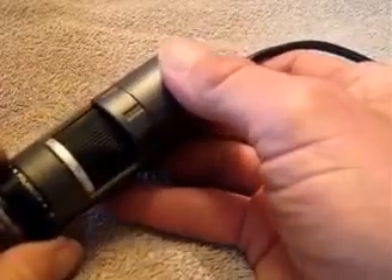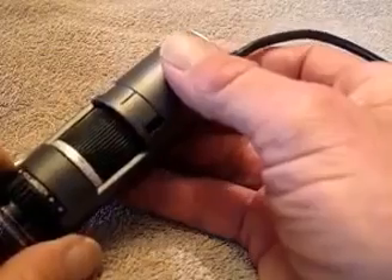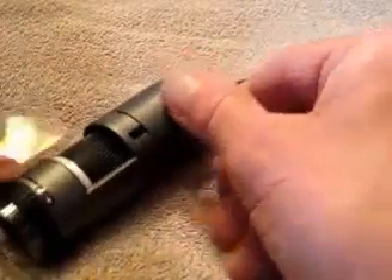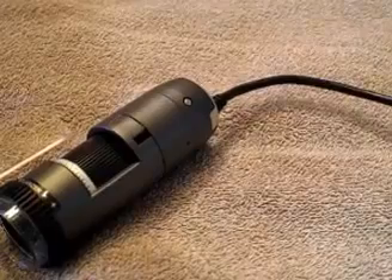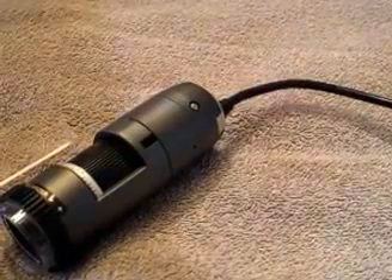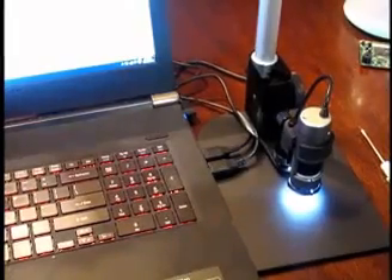A lot of times you just want to see something and don't necessarily need to measure it, but if you do, this makes that possible. I'm going to come back in a minute — we're going to have the microscope set up on the stand and show you what it'll do.